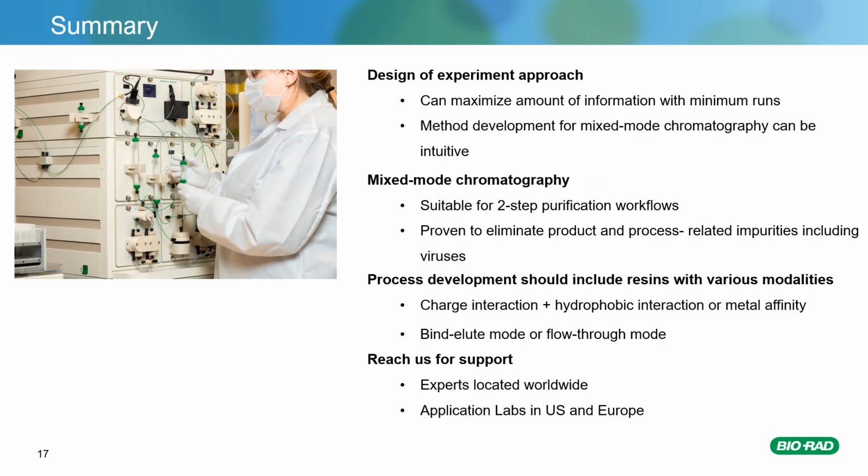In summary, the design of experiment approach is a very useful tool to improve the efficiency of process development. It can help you more quickly and deeply understand the process, which can particularly be useful when working with mixed mode resins. We can see in the field that two-step purification workflows with mixed mode resins are becoming more and more popular.